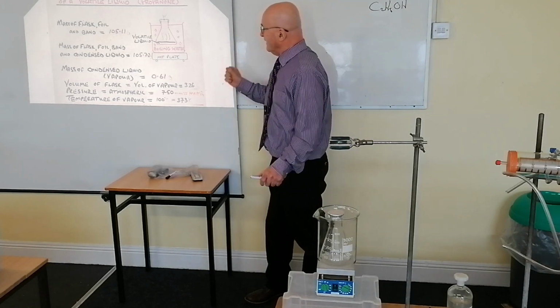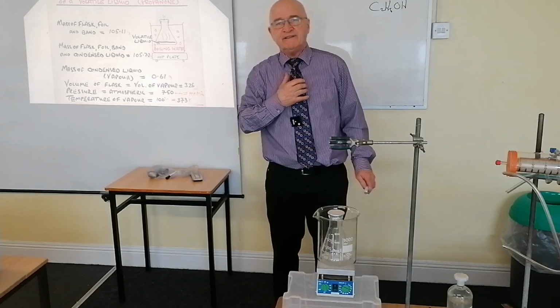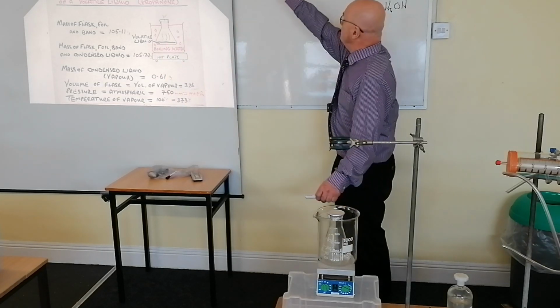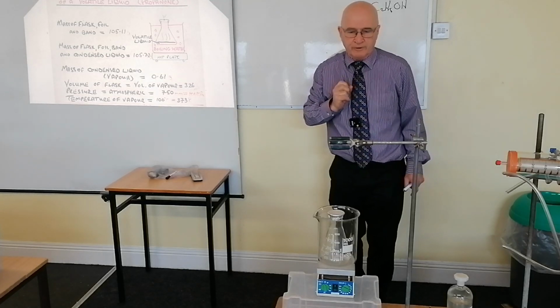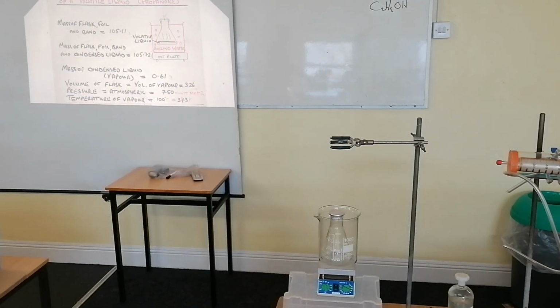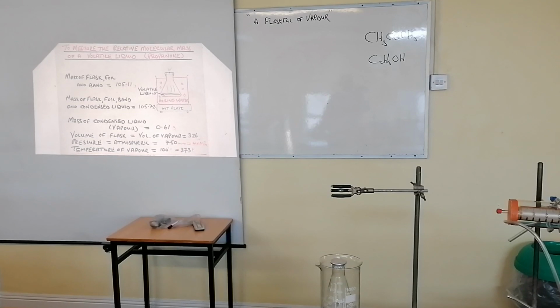So what you do here next then is you watch this very carefully, this liquid inside the flask, until such time as the last drop of it disappears. Now, that's a very important idea, the last drop disappearing, because when the last drop disappears, you have a flask full of vapor. Okay, very, very important. Now, you've seen the apparatus. I'm going to bring the camera back up again. I think you generally have the idea as to what's going on there. You proceed to immerse it in water, and that's very important, all right? Just want to bring it back up so I can use my board. All right, and there you go. So you have a flask full of vapor there, and that's rather important.